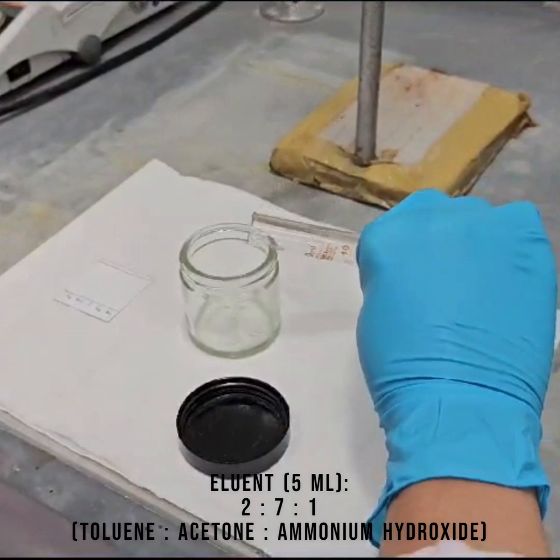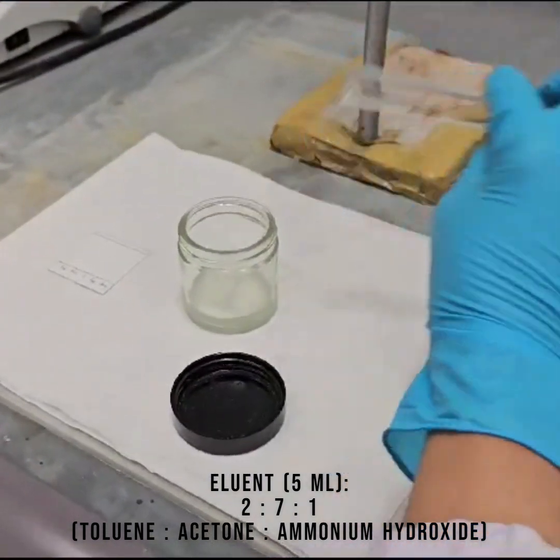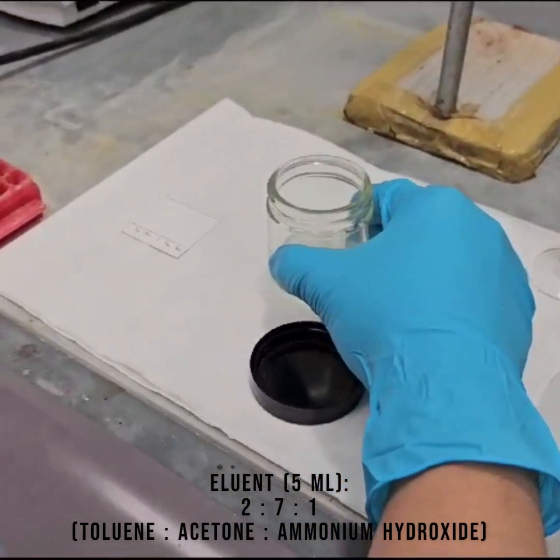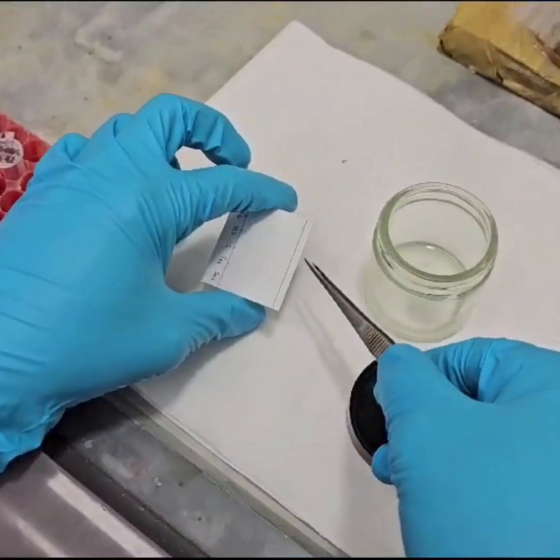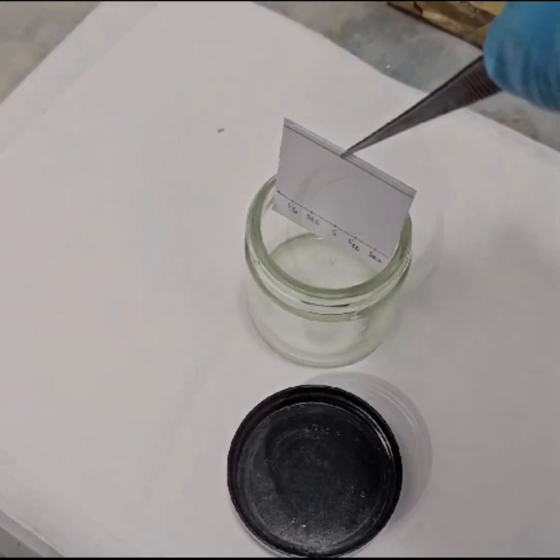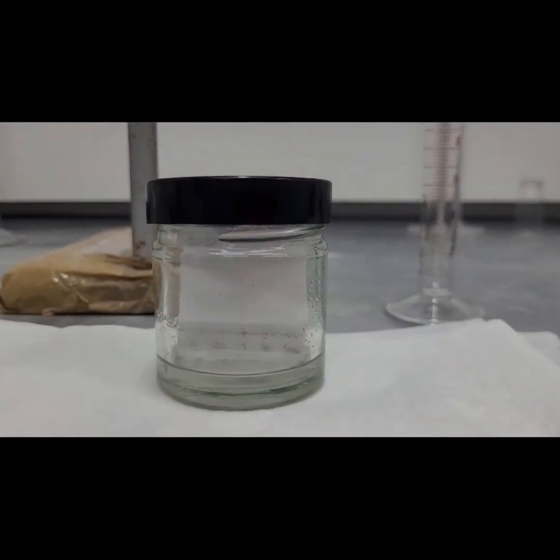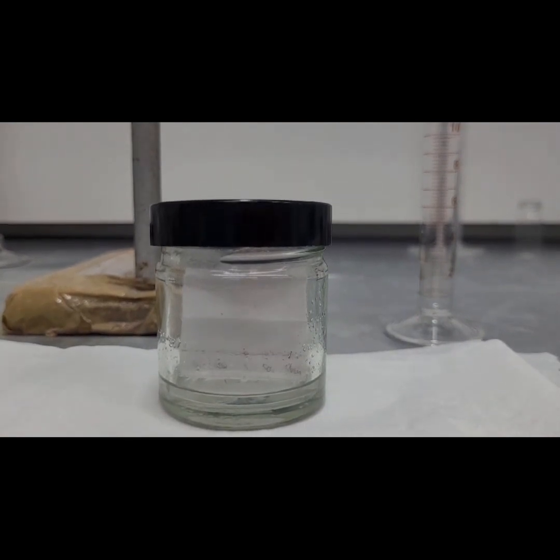Then, the TLC solvent, made up of the following components, should be poured into the TLC chamber. Swirl the chamber thoroughly to ensure good mixing. Next, using the forceps, gently place the TLC plate into the chamber. Allow the solvent to rise on the TLC plate by capillary action. This should take about 2 to 3 minutes.